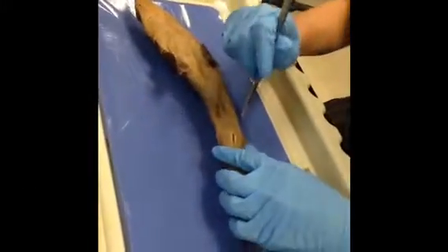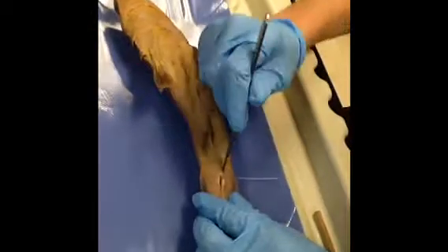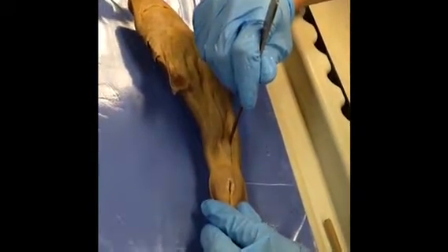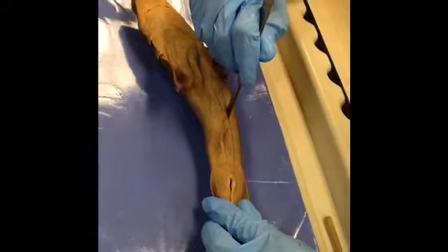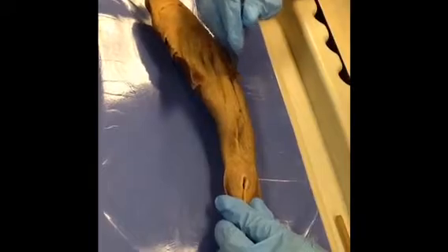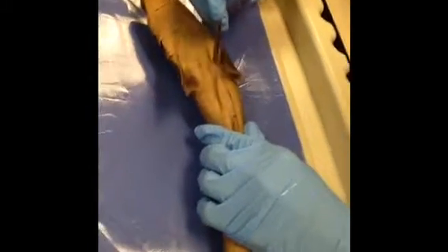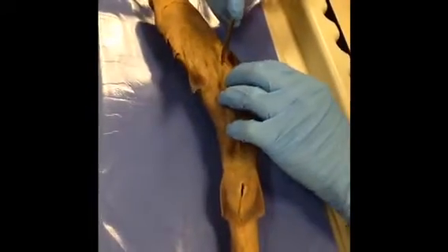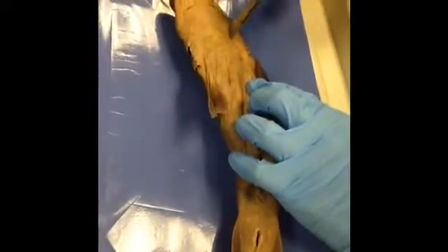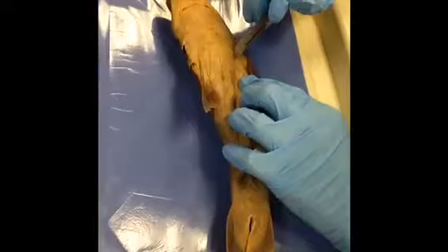Okay. We'll be making an incision right here in the pelvis area, cutting through the muscle. Sharks are very muscular, which they use to swim. Lots of swimming. They are coelomate, which means they have a body cavity. We'll just cut right past the pectoral fin, right up to the jaw, to the mouth, right there.